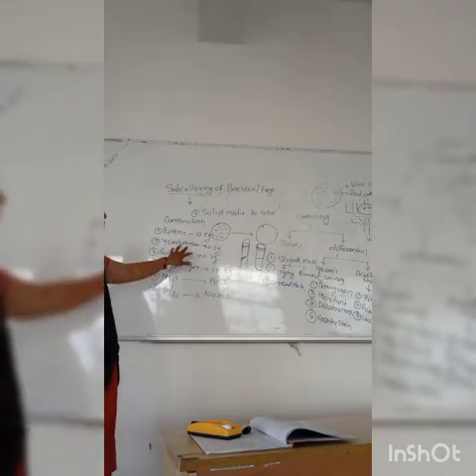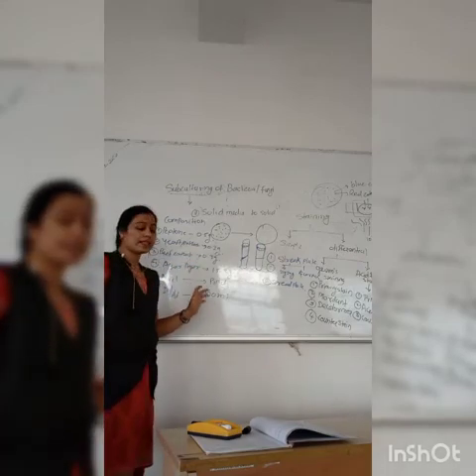So this is the composition of nutrient agar. We require peptone, yeast extract, beef extract, agar, NaCl.